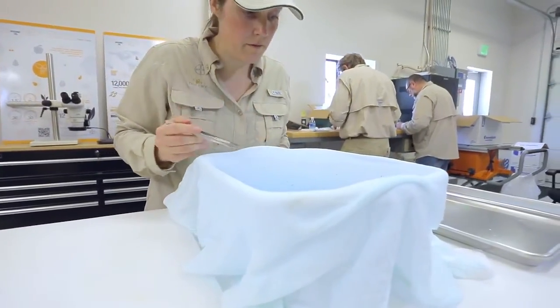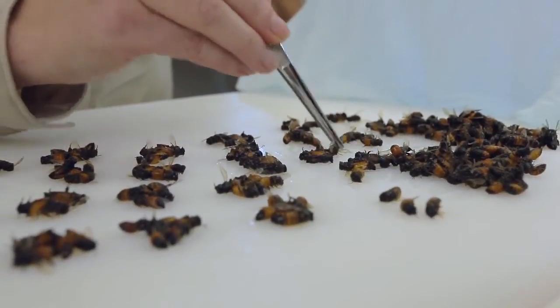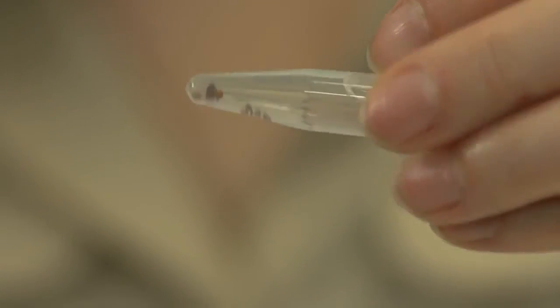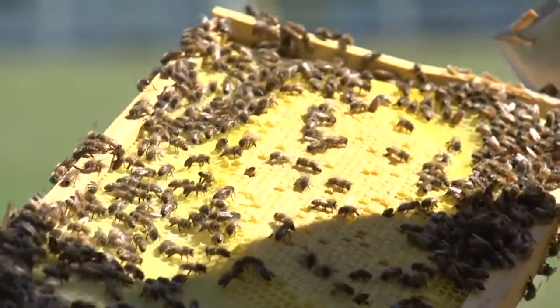Count mites on the cloth and record the number. Next, count your bees and record that number. Save the washed bee sample for nosema and tracheal mite analysis at some future point, then return the sample to the freezer. Varroa mite is the number one enemy of honeybees and the most significant challenge to bee health. Hopefully these varroa monitoring methods will help with improving management of this significant honeybee pest.